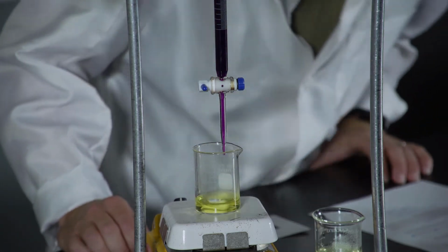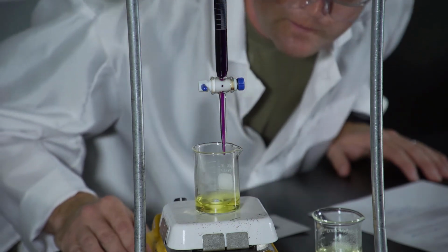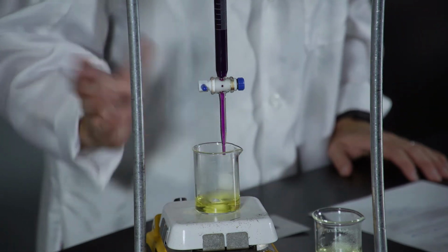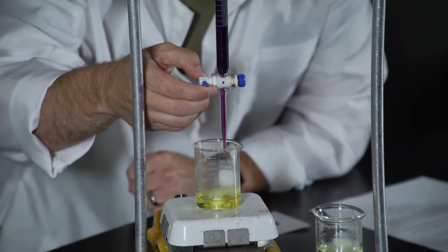See some condensation starting to form on the sides of the beaker. That's probably good. So we'll just turn the heat all the way off. Obviously keep the stirring going, and now we can start to add our potassium permanganate.